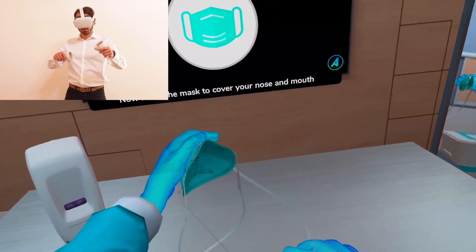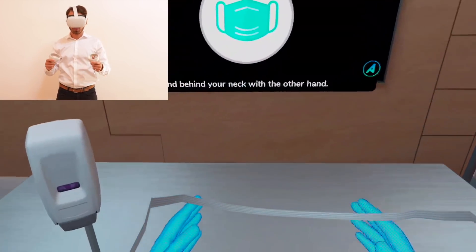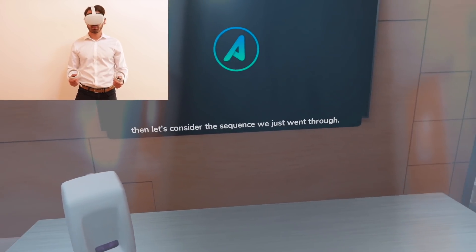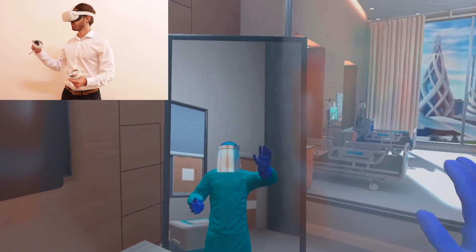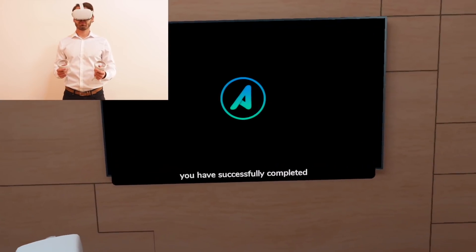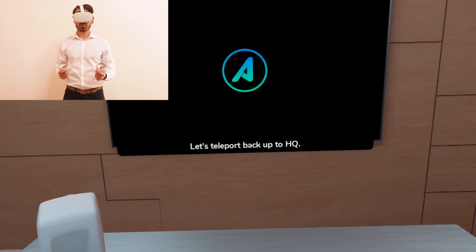Now move the mask to cover your nose and mouth with one hand, and pull the strap over your head and behind your neck with the other hand. Take a moment to look at yourself in the mirror, then let's consider the sequence we just went through. Congratulations, you have successfully completed the donning and doffing tutorial. Let's teleport back up to HQ.